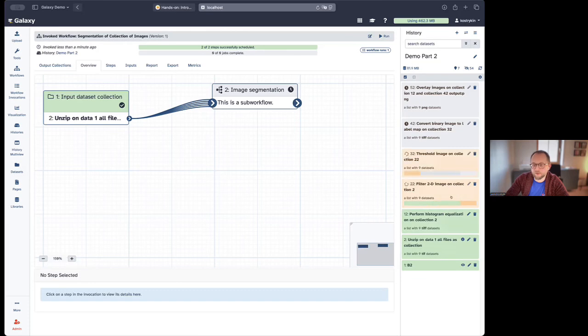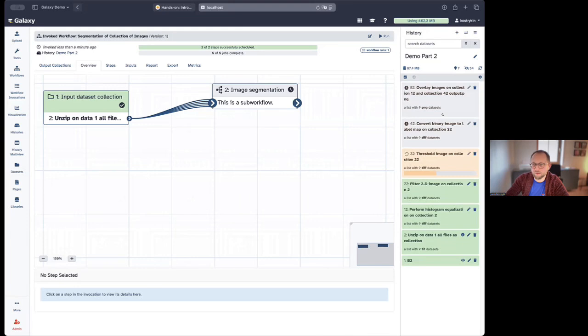So they turn from gray to orange to green. And at the final stage, you will have a collection of 9 segmented images. Let's wait for this.